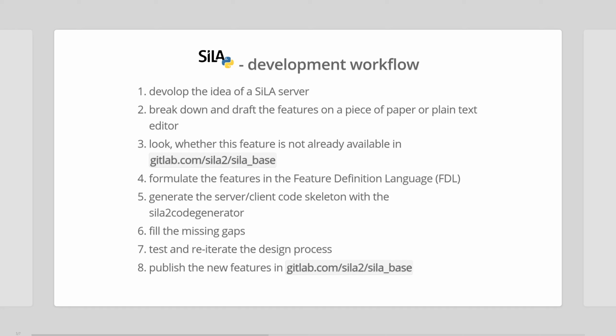And then break down and draft the features of this server just on a piece of paper or a plain text editor. So don't use any complex tools for that. You don't need them. They just distract you.